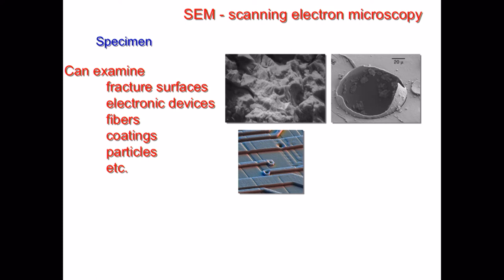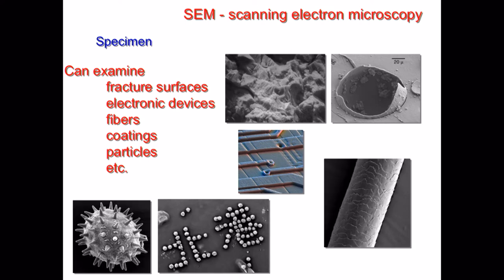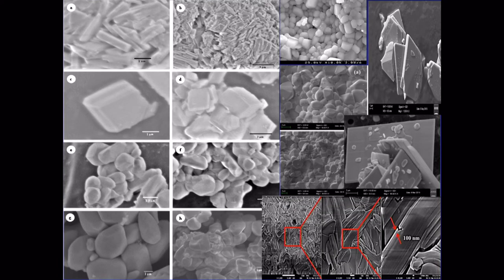And also you can have a surface as well as cross-sectional view. Even if you have surfaces, you can make a cross-section and see the cross-sectional view also, right? This is the layered thing, which we made as a cross-sectional one.